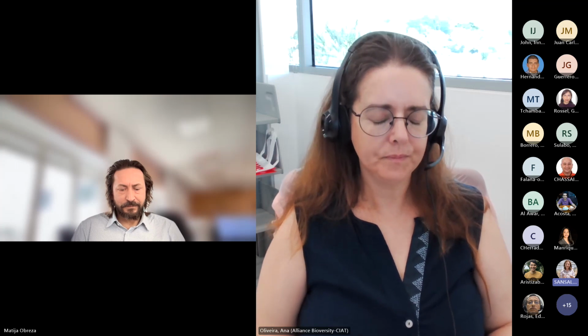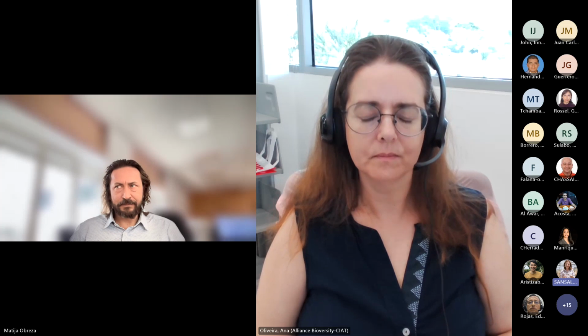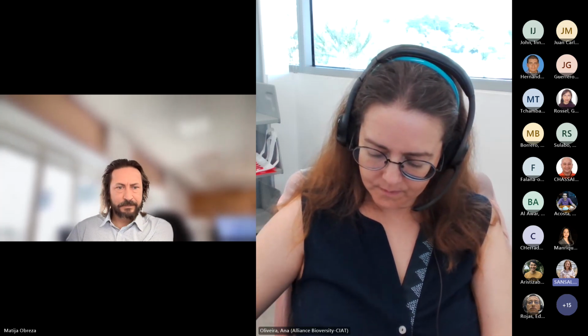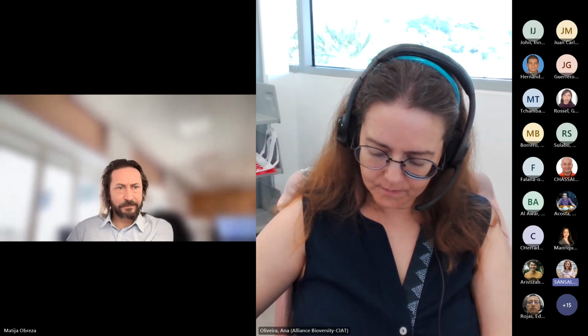Right now, as you know, CIMMYT is currently very active using GGCE. So all the guys are here. They are better placed to answer because they work every day with GGCE. And Rocio is also here, and she worked with SMTA. But currently, we are working with EasySMTA, which is very nice because we report automatically to FAO.